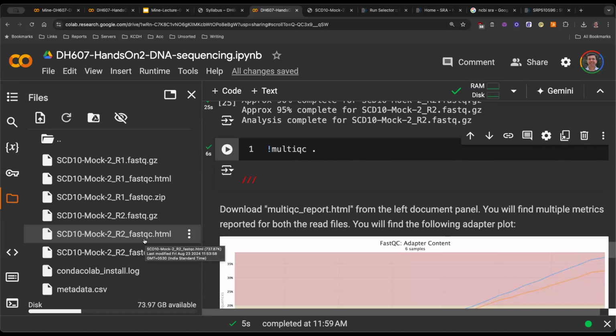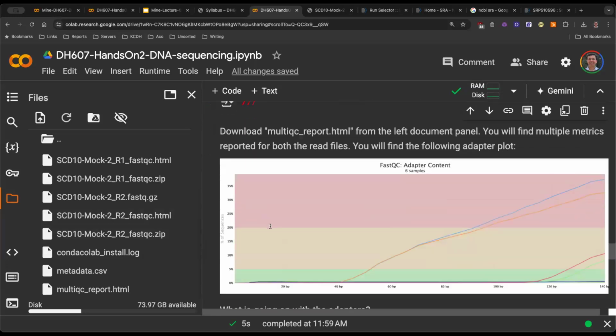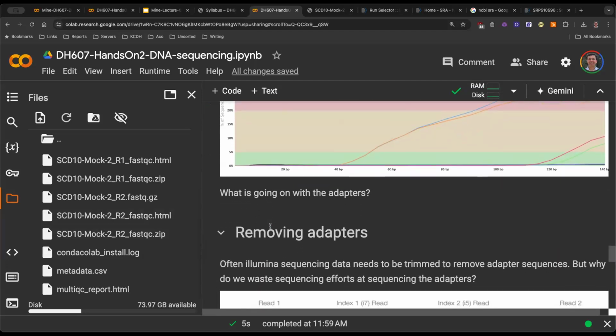They're happening in all the reads. Yes, they are happening in all the reads. There is abundance of nucleotides and there is abundance of polymerase, so it's happening in parallel everywhere. Okay, very good question. Does everyone understand what is happening? Anyone not clear on what I just drew? Clear? Okay.